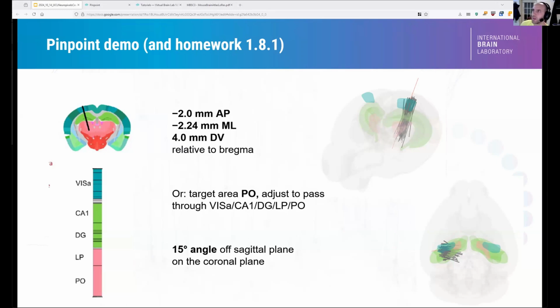Yep. So if you watch any of the old videos from previous Neuropixels courses, you'll see two other trajectory explorers. The original one that Andy put together, and Herbs, which is another option. Both of those work great. I think we've been moving a little faster with Pinpoint and hopefully keeping it up to date, adding many more atlases into Pinpoint, adding many more probes.